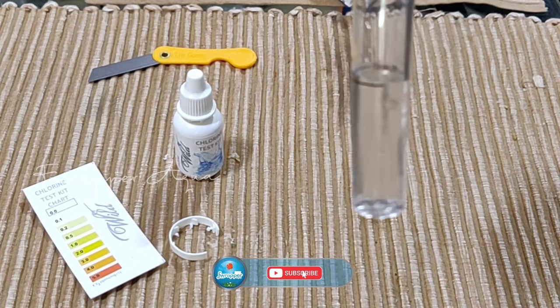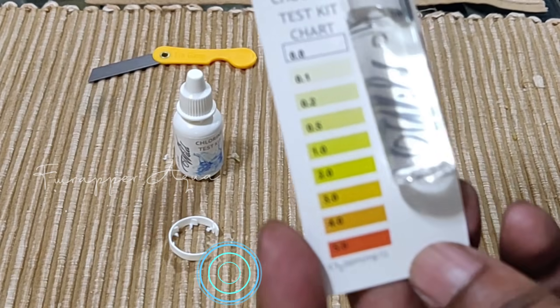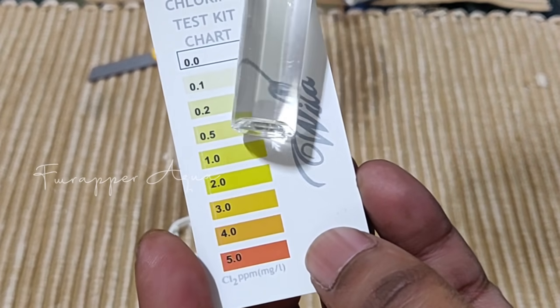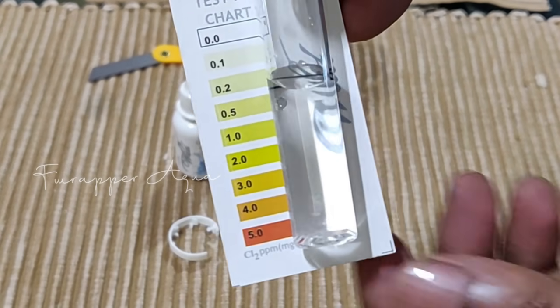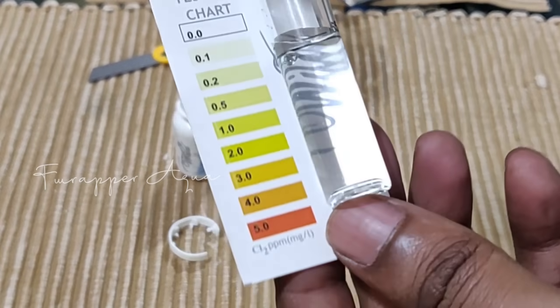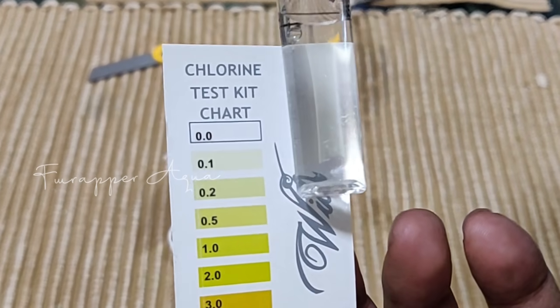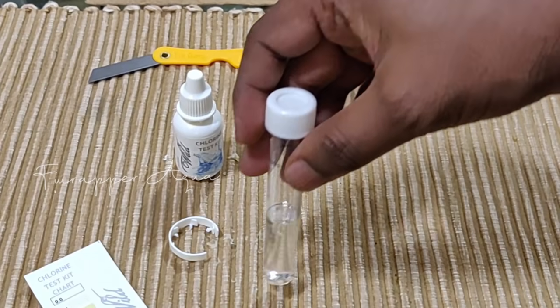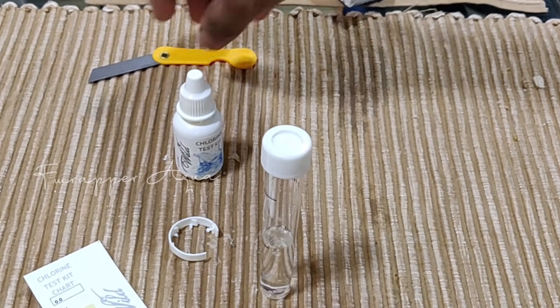So it seems like I don't have chlorine in my tap water. As per the chart, you can see there is no chlorine. Maybe I'll get some chlorinated water to show you the color difference. I was always thinking there is chlorine in the water, but as per this test there is no chlorine.